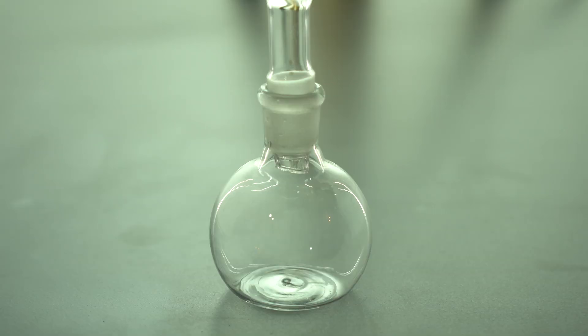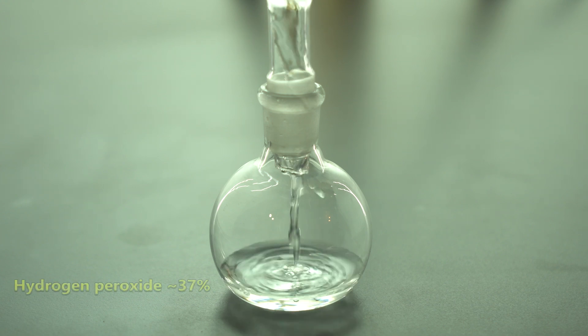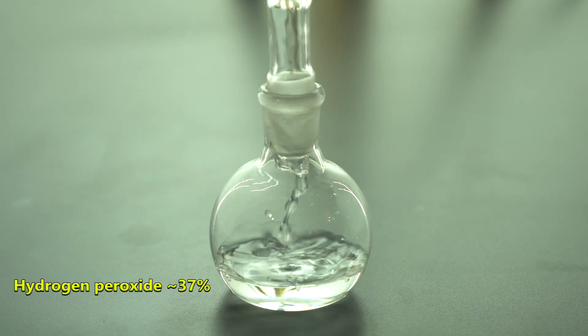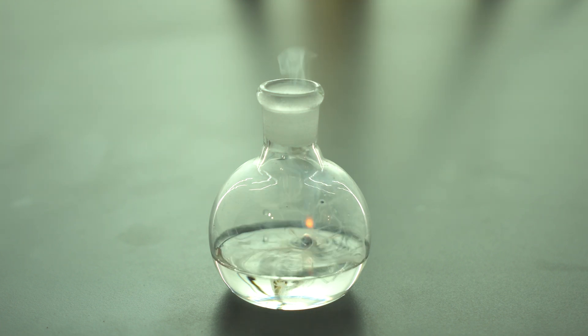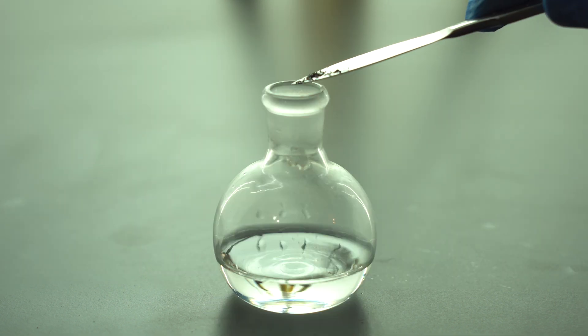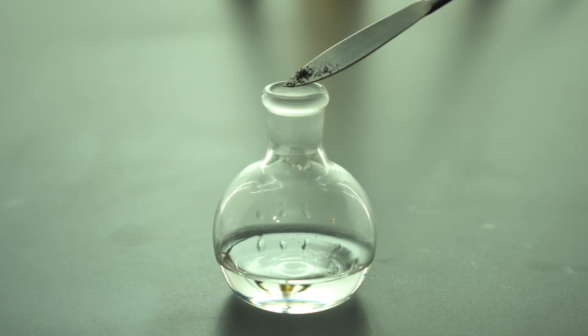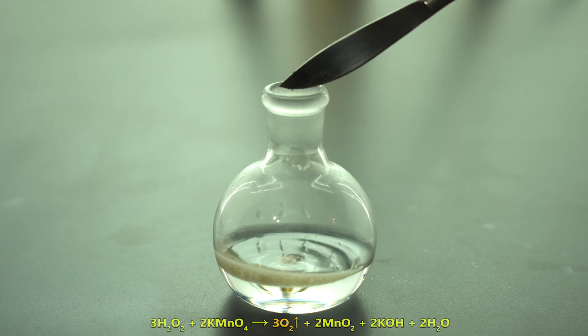First, let's compare the reaction of potassium with hydrogen peroxide and the one with decomposing hydrogen peroxide. I pour hydrogen peroxide into a small flask and drop a small piece of potassium. And now I add several potassium permanganate crystals in the flask with hydrogen peroxide, which will cause intense oxygen evolution.